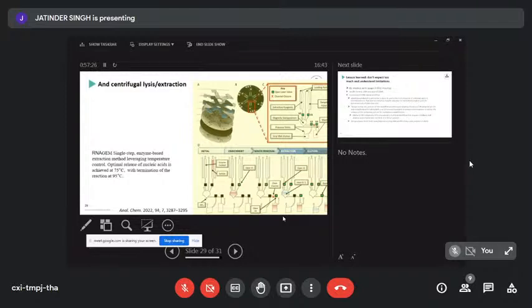Then the magic lysis buffer comes in, lyses the viral particles that have been collected there. They're magnetic particles, so a little bit of an electromagnet sitting under the spinning disk allows for the agitation. And then it's all eluted after popping the next valve with the laser. And then it's ready to be introduced in the other spinning disk to do the amplification and the detection.